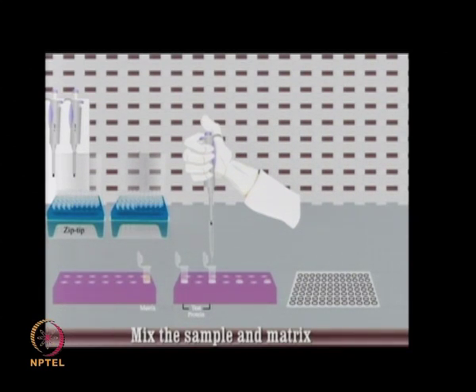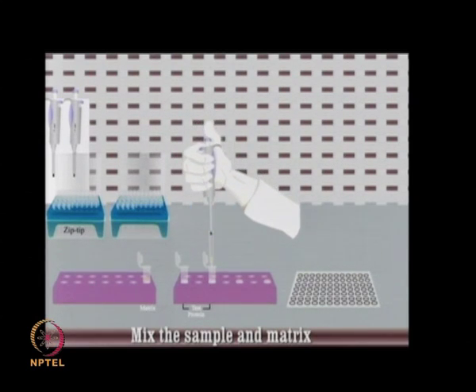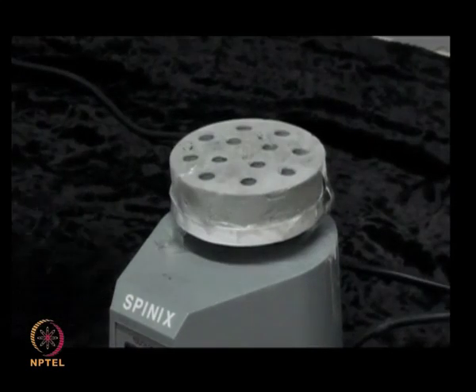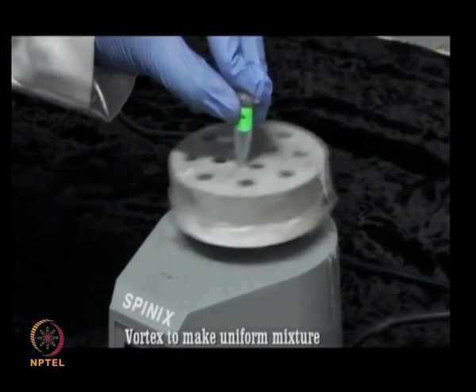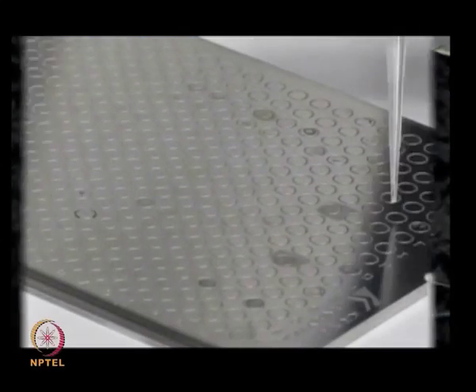MALDI is performed in two steps. In the first step, the compound for the analysis should be dissolved in a solvent containing small organic molecules known as matrix. This mixture is dried before analysis, and the liquid solvent used in the preparation of the solution is removed.